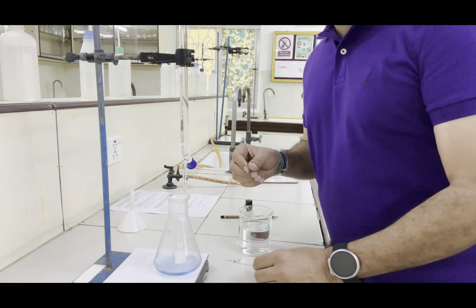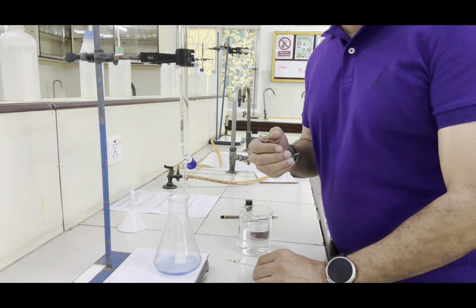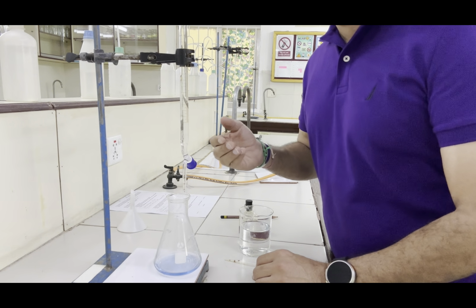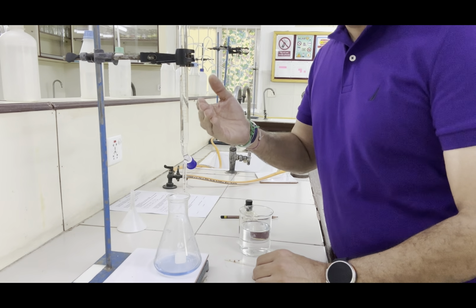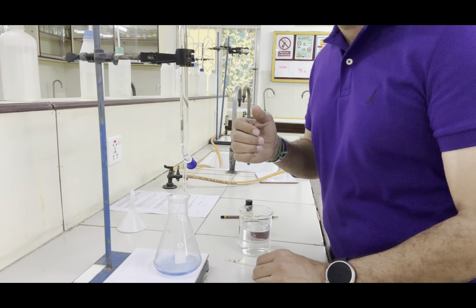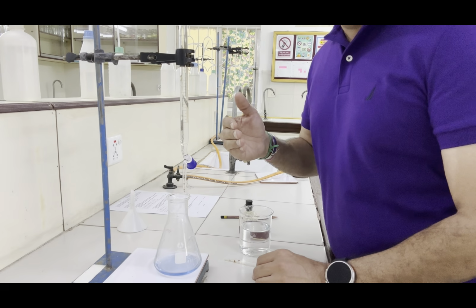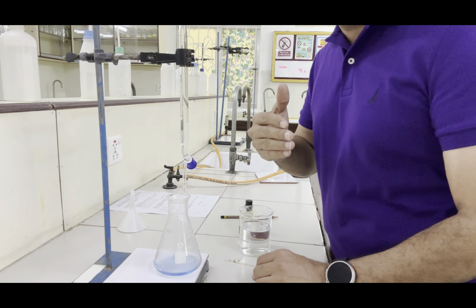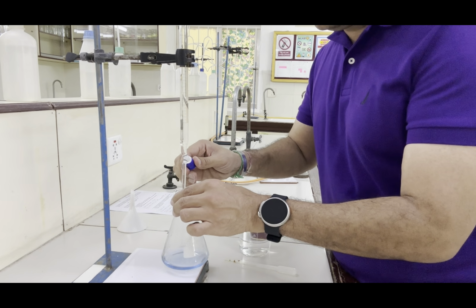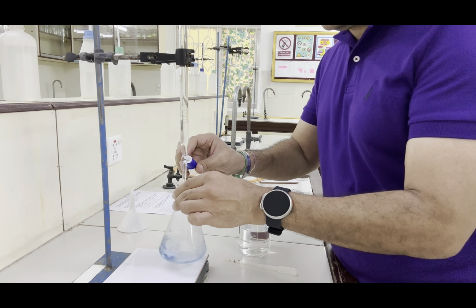Before I start, let me tell you one more thing about accurate titration. Accurate titration means you do not need to add even a few drops extra from the burette. Now, how can we achieve this? In the rough titration, we found 28.80 centimeter cube of volume used. Therefore, the volume for accurate titration must be lesser than that. So as soon as I start pouring in the solution, I will stop adding near this 28.8 mark.